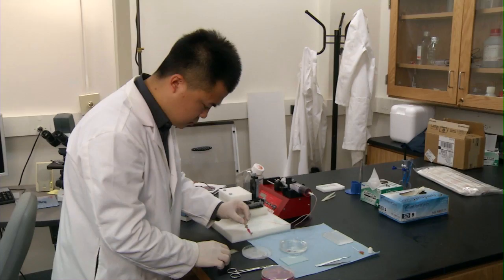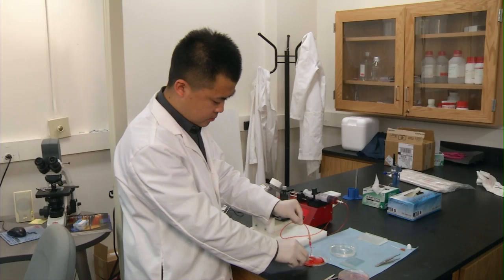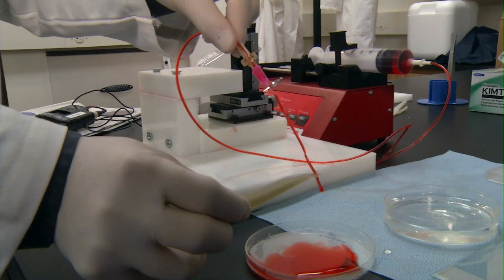They look like blood vessels and we can directly print them. And when we print them, we can give any complex shape we want. But engineers aren't doctors, which is why the research team on this project has students and researchers from a variety of backgrounds and disciplines, including Yin Yu, who received his medical degree in China before coming to the University of Iowa. I can apply my medical knowledge and background into this engineering field, because people in engineering don't know too much about biology. They need people from biology and medicine to cooperate to make this field move forward.